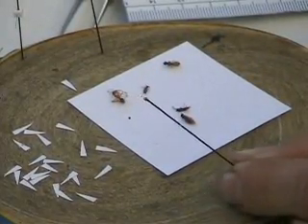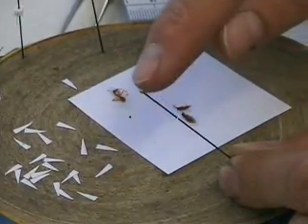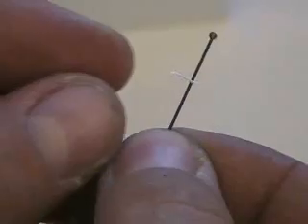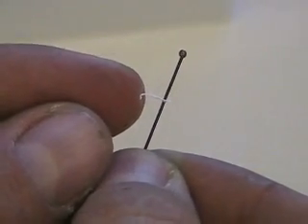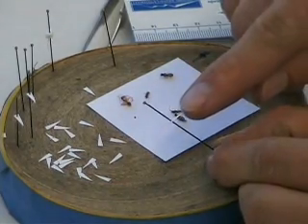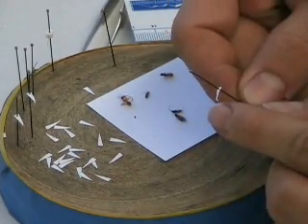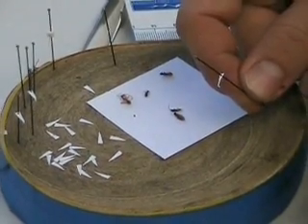Leave at least 10 millimeters from the point to the tip of the pin. Then with your finger, you just carefully bend the very tip of this point. When you bend that tip, it makes a little flat end at the end of that point. At the end of that point, you're going to put glue and then use it to stick onto your specimen.